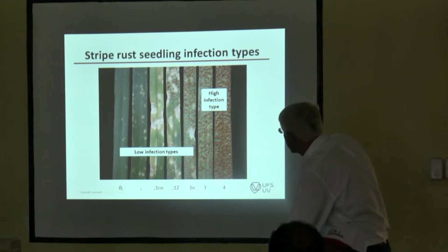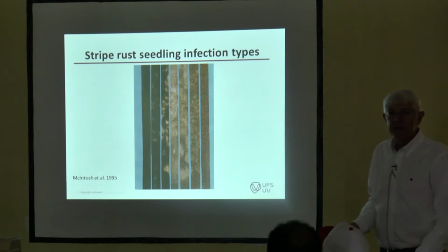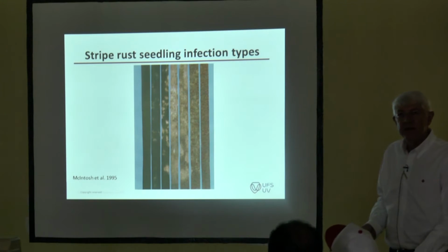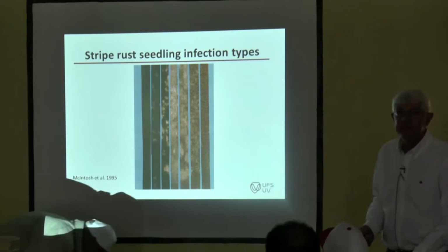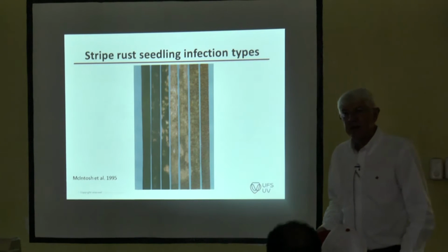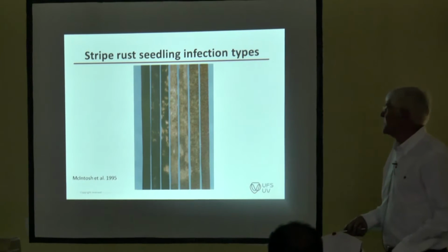And some of the reactions at the bottom. I use 0 to 4, and for my purposes, I think that's sufficient. Yeah, so we normally use this 0 to 9 scale. The advantage, we think, is that we have intermediates as well, and sometimes we can differentiate some reactions based on the intermediates. Yeah, 0 to 9 is very common. So you can decide in your situation which one will suit you best.